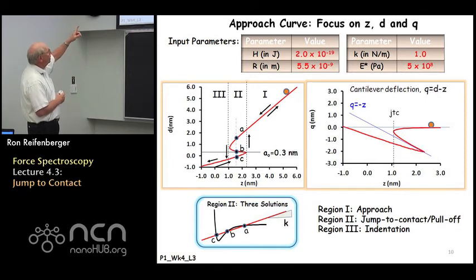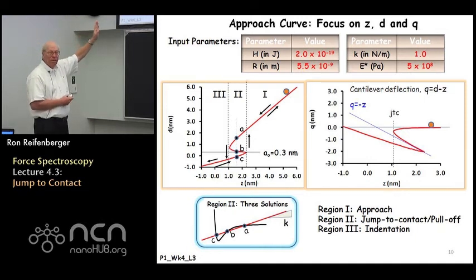So if I take these 2 equations for the 2 regimes, D less than A0, D greater than A0, I can make a plot of Z versus D, and when I do that, I get a plot that looks like the one shown in the left-hand region of this curve, right? And you'll notice that this plot has multiple values depending on what region of Z you're at.